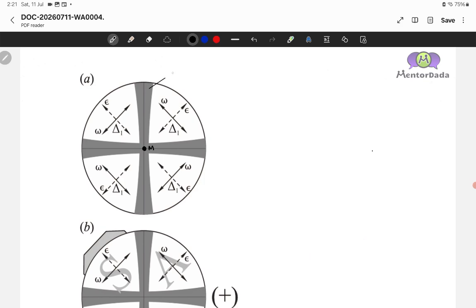So these crosshairs are representing the isogyres, right? These are isogyres. And look at the melatope, the retardation amount is exactly 0 because the optic axis is present along the melatope, right? So as you go away from this melatope, you will see that the retardation is increasing gradually.